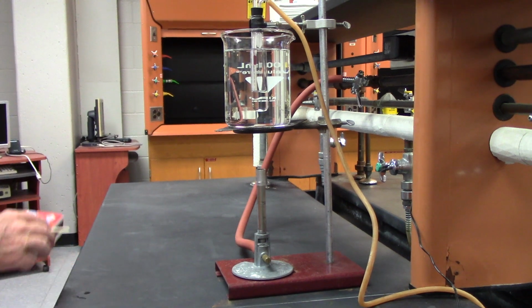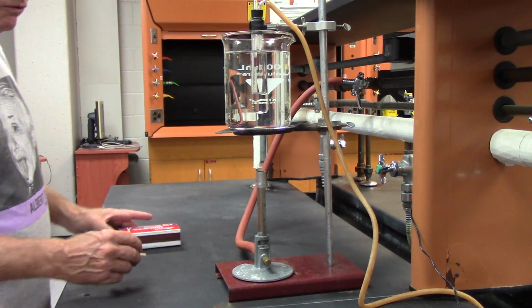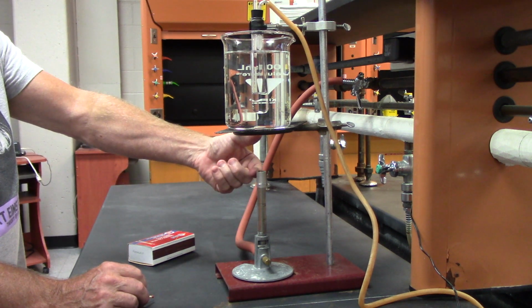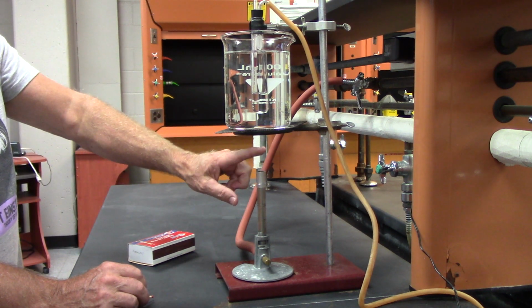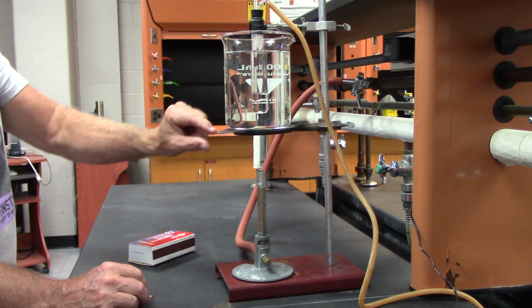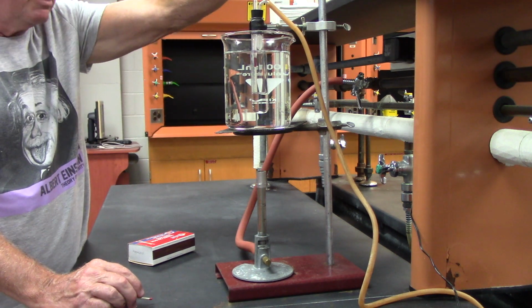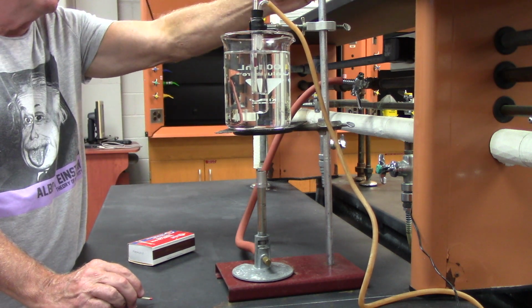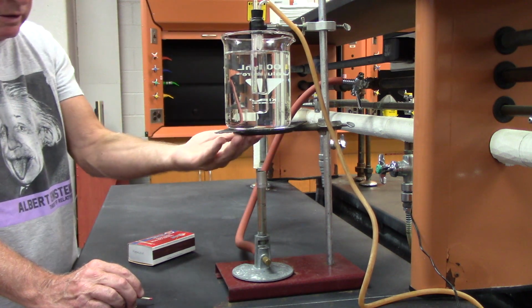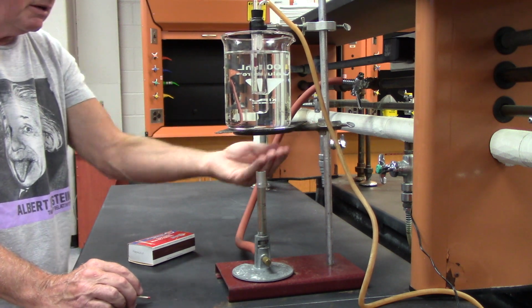Actually, the best way to do this is doing it yourselves, but you're not here, so I'm going to do it for you. Notice I leave about 2 inches between the tip of the Bunsen burner and the wire gauze. This is a ring stand, and this piece holding it up is an iron ring.